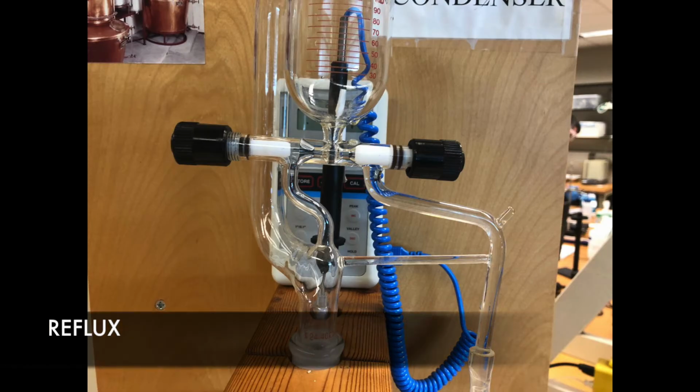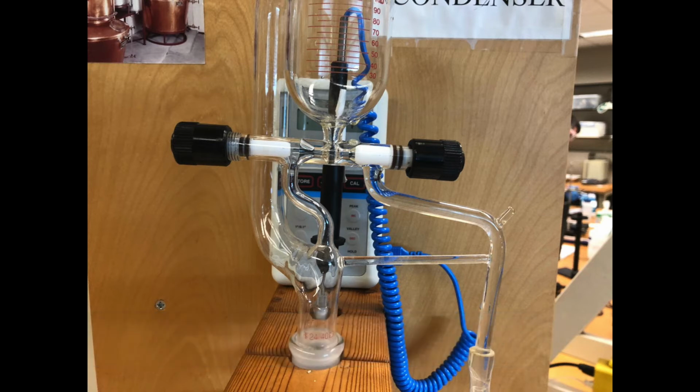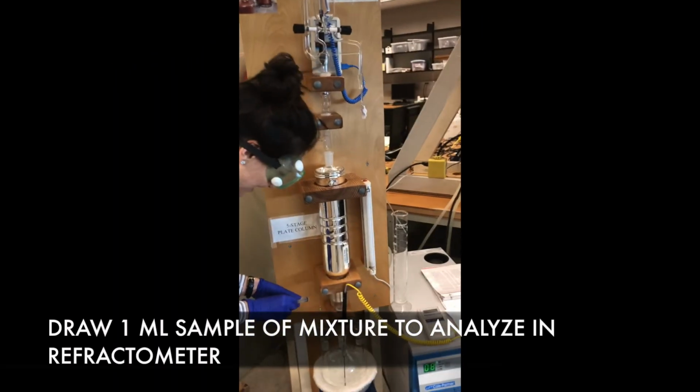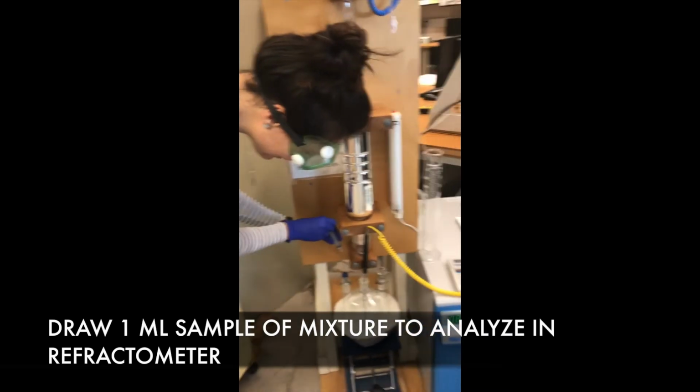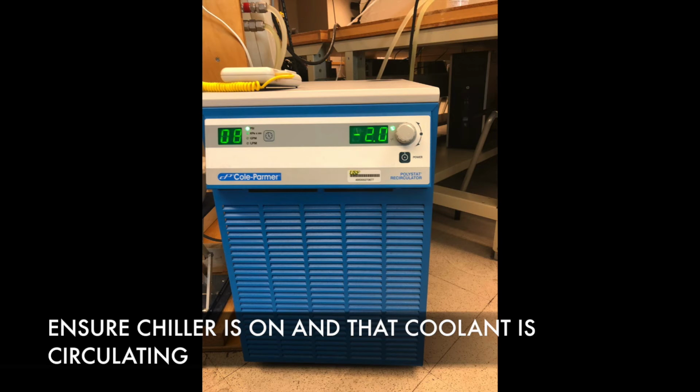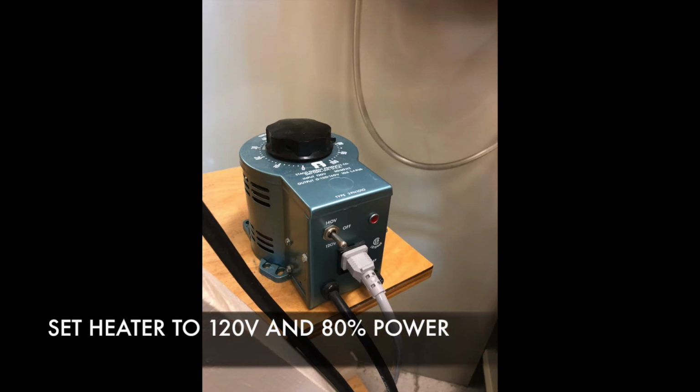Here we have our reflux, which uses valves to control the flow of the vapor that goes back down into the column, as well as the condenser, which condenses the vapor into liquid. First, we will take a sample of 1 milliliter from the mixture to analyze in the refractometer. We will first begin by turning the chiller on, which needs to be on 20 minutes prior to beginning the experiment. Now turn the heater on to 120 volt power and set it at 80%.